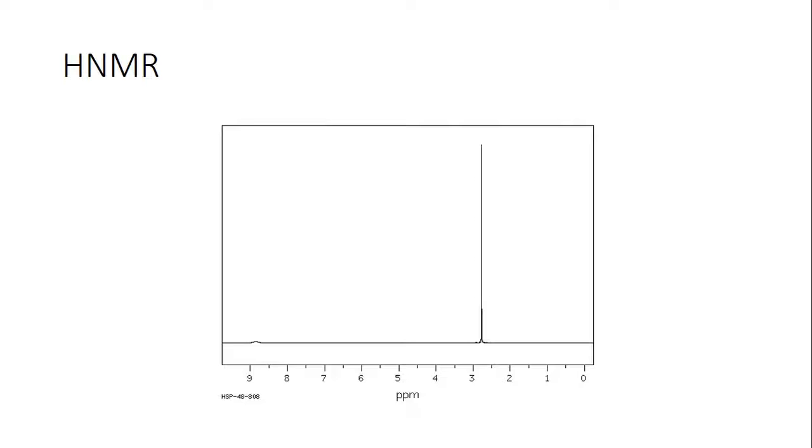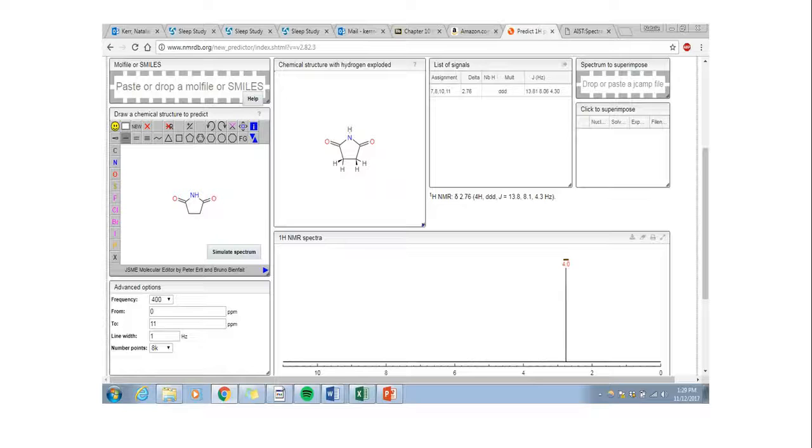Each molecule has different regions for carbons and hydrogens, and NMR-DB is a really good site to use as a tool to help you determine how many of them there are. The number of peaks on the graphs corresponds to the different regions, so this is something you want to pay attention to. If you go to the site and put in your molecule, here on the right, it'll blow it up and show where the hydrogens are attached. These 4 hydrogens on the bottom of the molecule all correspond to the same section, and then this one on the top is its own little deal.